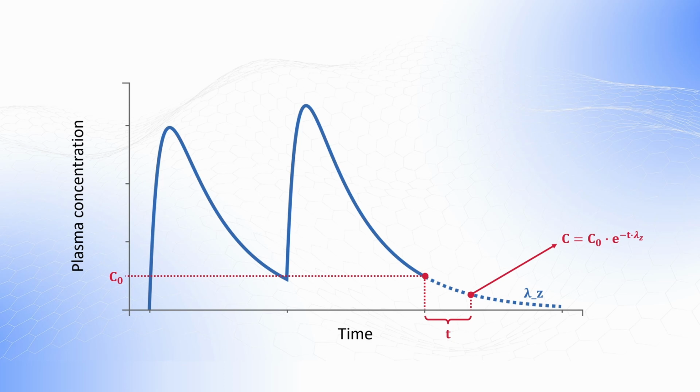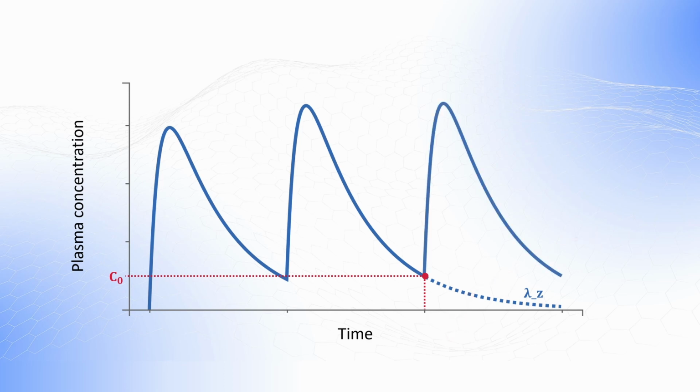Let's add an additional steady-state dose, for which we have measured concentrations, to our scheme. The Cmax of the first dose, which we want to calculate, is actually the same as the distance between the Cmax at steady state and the carryover concentration corresponding to the first and second dose only. We need to calculate this carryover concentration at time equal to Tmax.